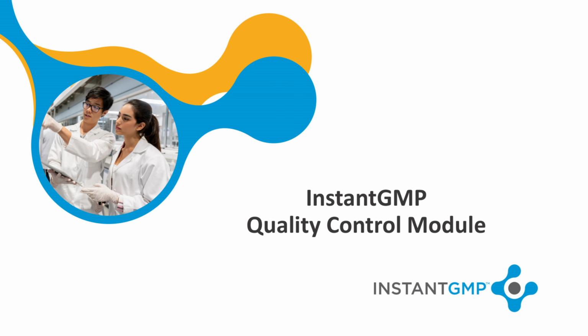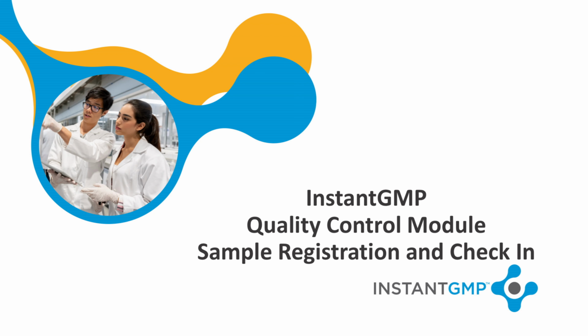This training video will show the activities assigned to quality operators and laboratory analysts who will register, check in, and test a quality control sample using the InstantGMP Quality Control module. Let's start on the manufacturing floor where a sample is taken and registered.